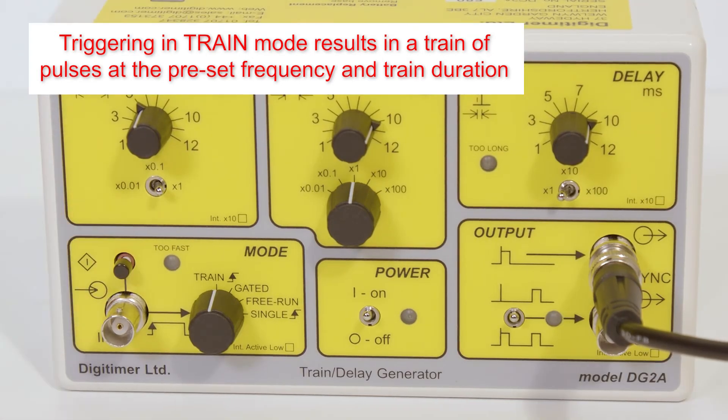Here, a five-second long train at 10Hz is delivered, indicated by the flashes of the amber output LED.